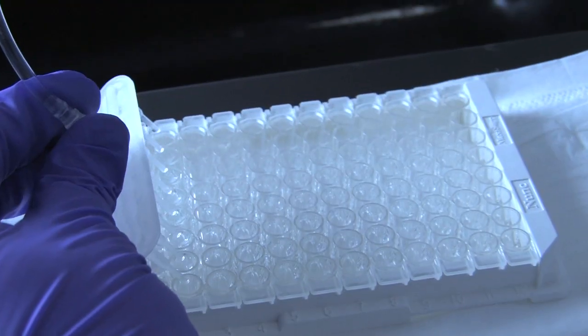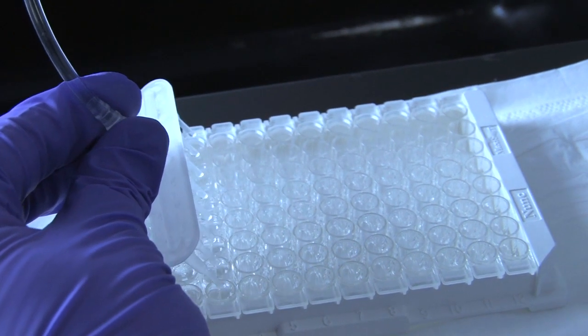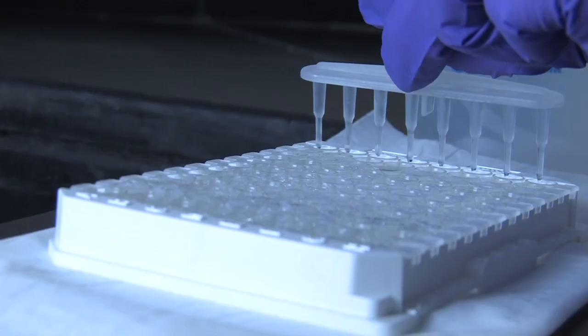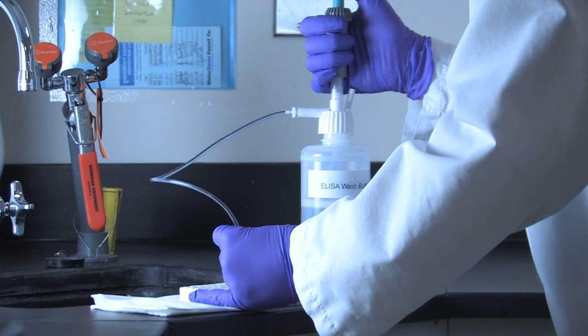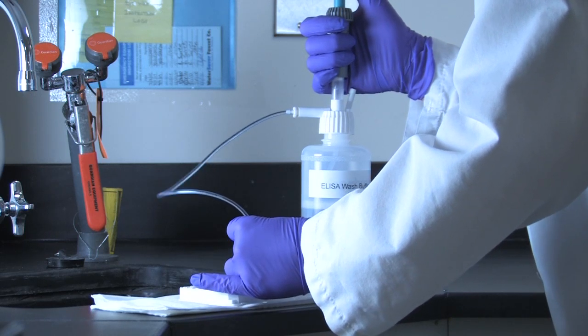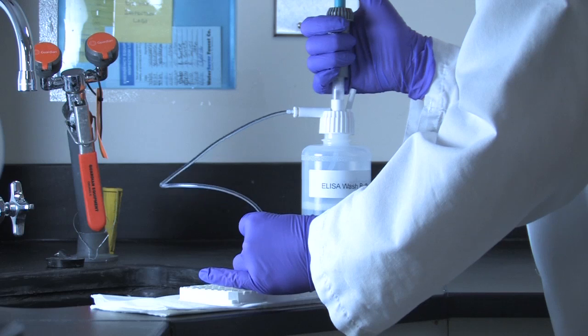Using the prepared wash bottle, fill the wells evenly across the plate with wash buffer. Working methodically, the liquid should be dispensed with force in order to properly agitate the contents and remove any unbound material.